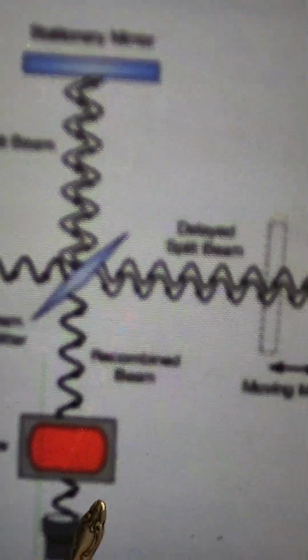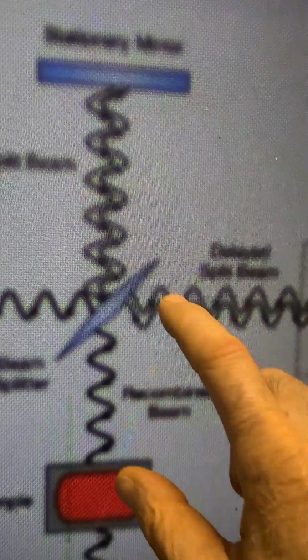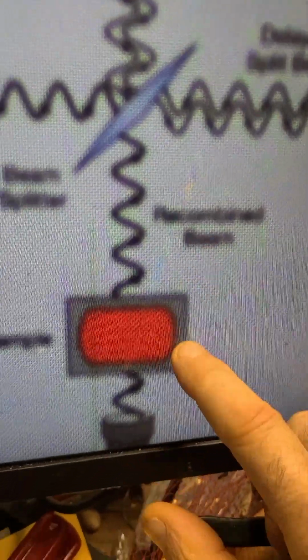very well horizontal and vertical, and do not wibbly wobble, so that the light from one spot on your emitter bounces and then recombines at a very certain spot, coming through space.